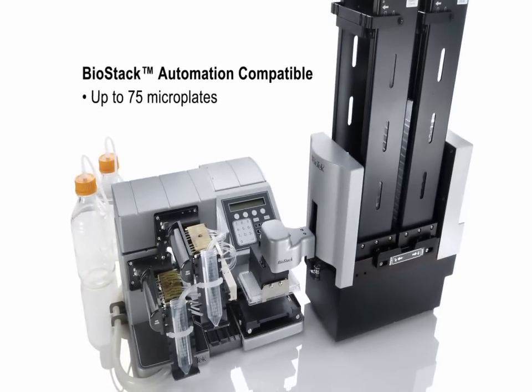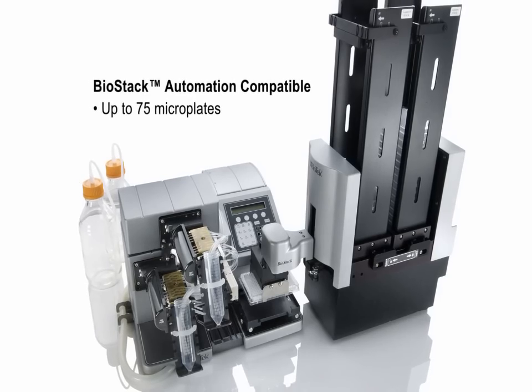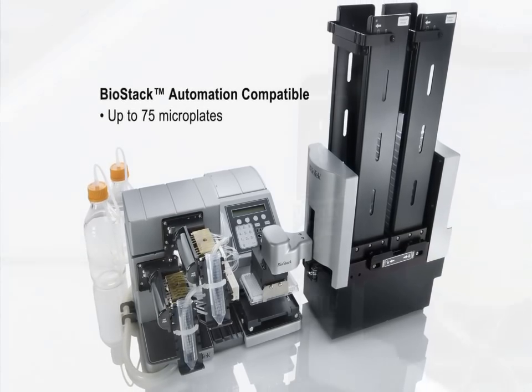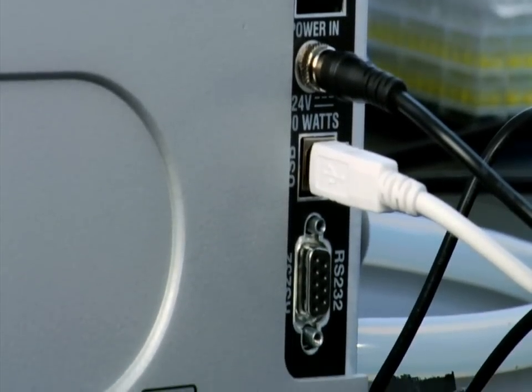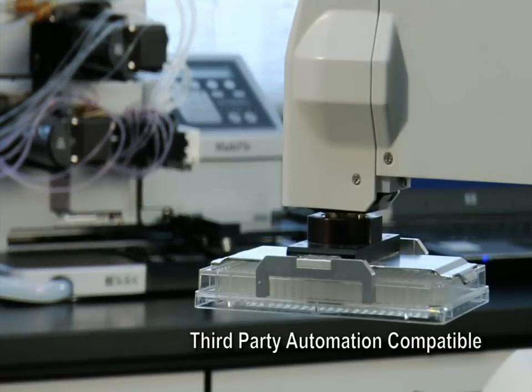The Multi-Flow dispenses up to 75 microplates with unattended operation. For increased throughput and integration to large workstations, the Multi-Flow can easily be accessed by third-party robotic arms and has been integrated to the majority of today's leading commercially available automated systems.